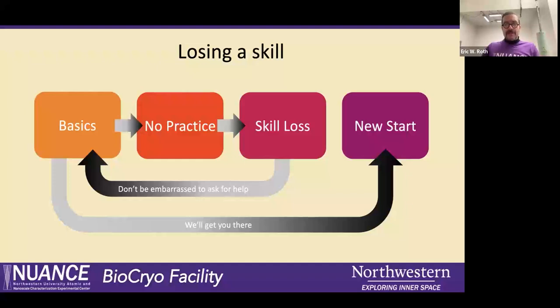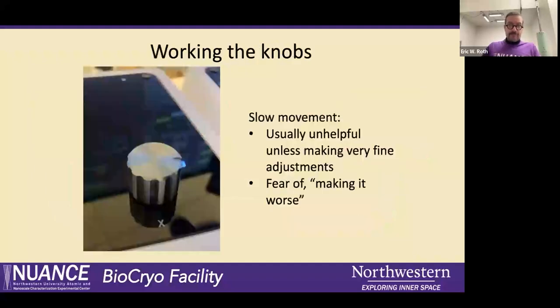The model I'm using for this talk is our JEOL 1400 TEM. That said, most of these apply to most TEMs and even some SEMs. The ways of doing things are slightly different, but the principles are all the same.